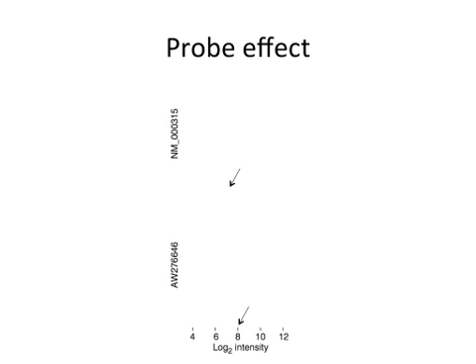All right, so let's take a closer look at what this means. So here are two genes. Now, instead of all this correlation between all samples, I'm actually taking it down to one gene, and that's already two genes. There are the names of the two genes, and down there is a scale of log2 intensity, and now there's a little arrow. That arrow is pointing at the value that I observed in a specific sample. They're both 8. That's what I'm showing you here.